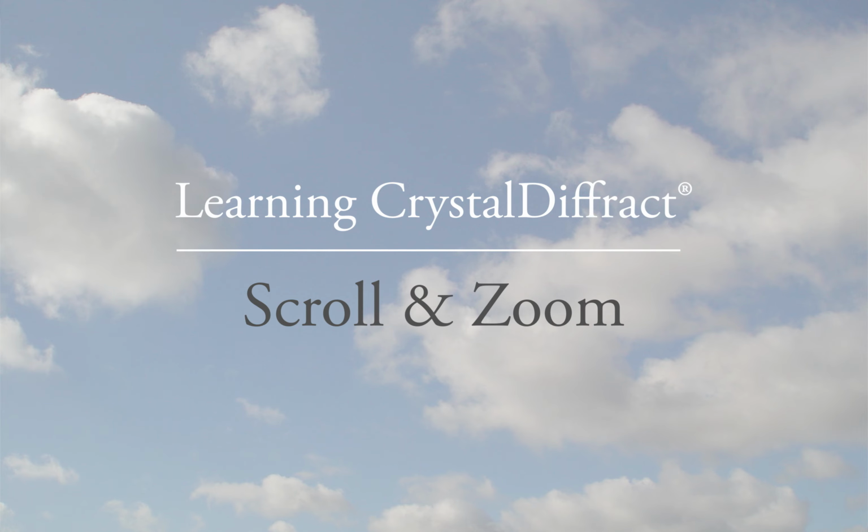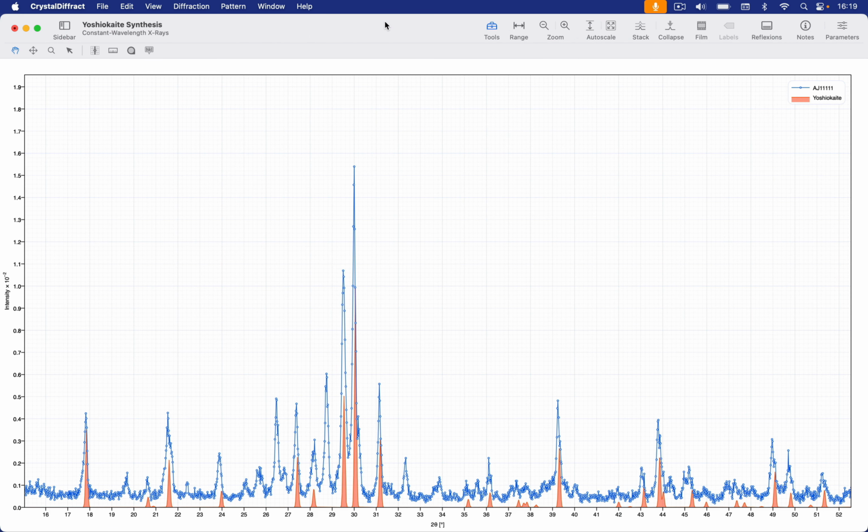Welcome to CrystalDiffract 7. In this tutorial we'll investigate ways of scrolling and zooming the diffraction pattern. Here's a typical diffraction document showing an observed pattern and its simulated counterpart.